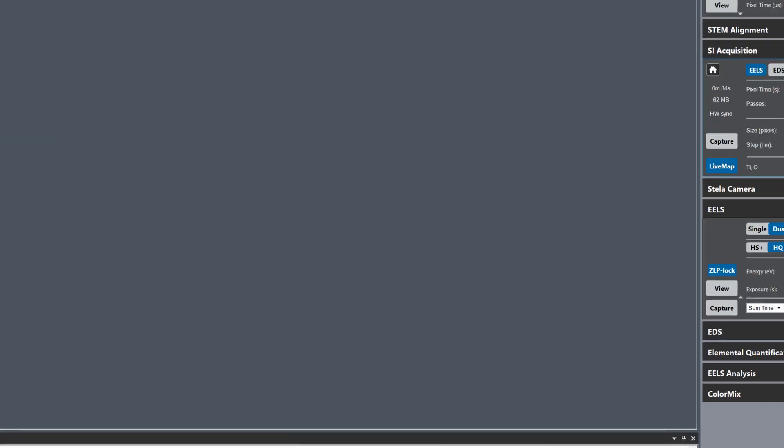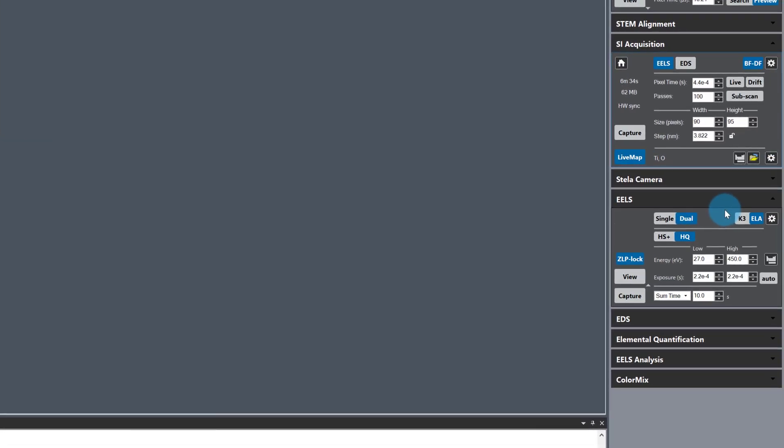To collect the low loss spectral data with the titanium and oxygen edges I'm interested in, I need to use dual EELS mode to extend the energy range.